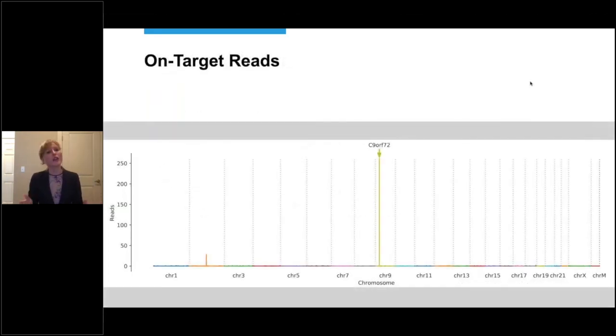And this is an example of on-target reads. You can see all the CCS reads for this particular individual, more than 250 and all the different chromosomes. And as expected, there was one big peak representing the C9ORF72 locus. And that's exactly what we wanted to see, a lot of on-target reads.